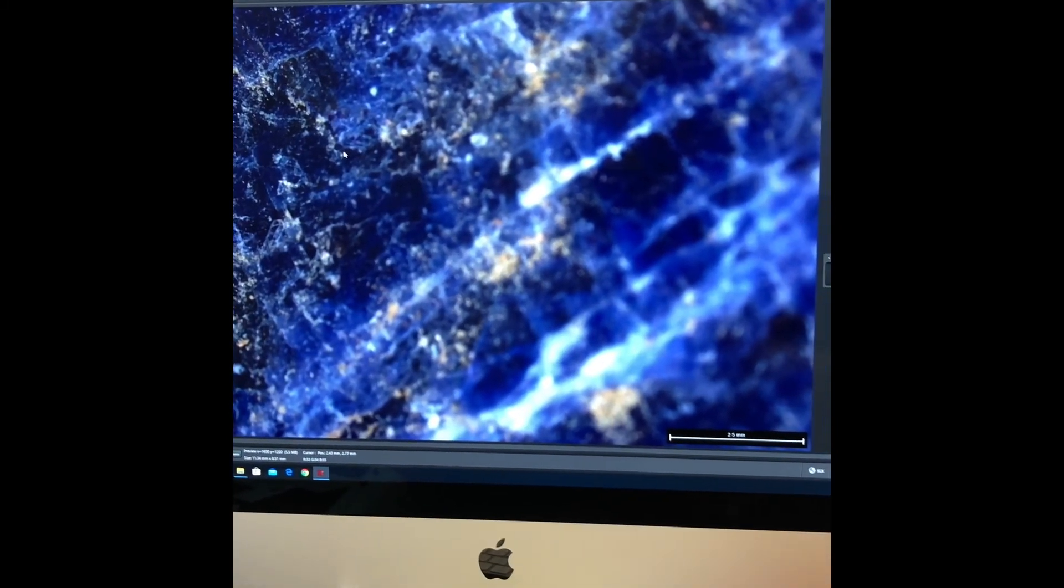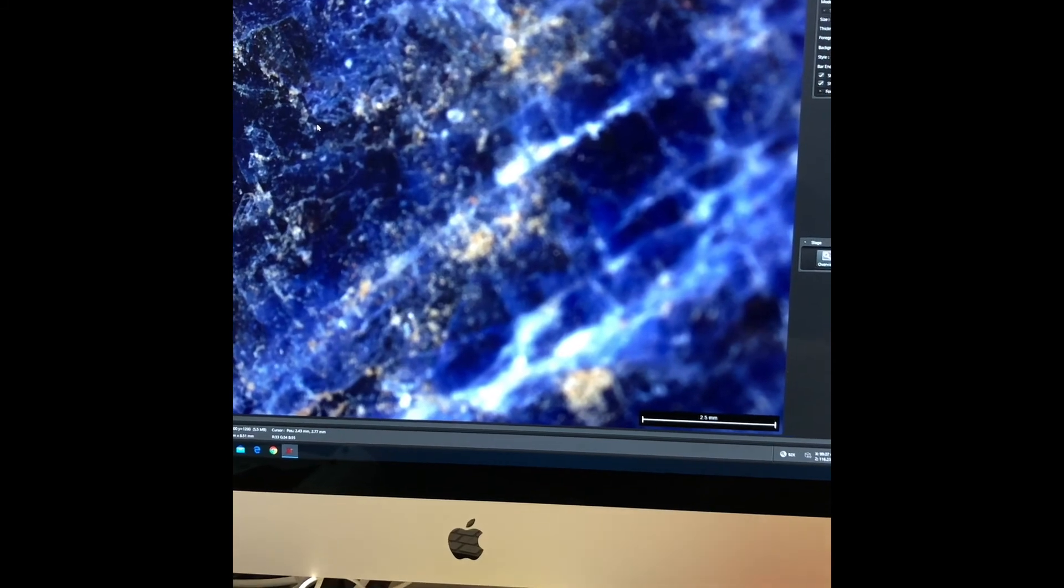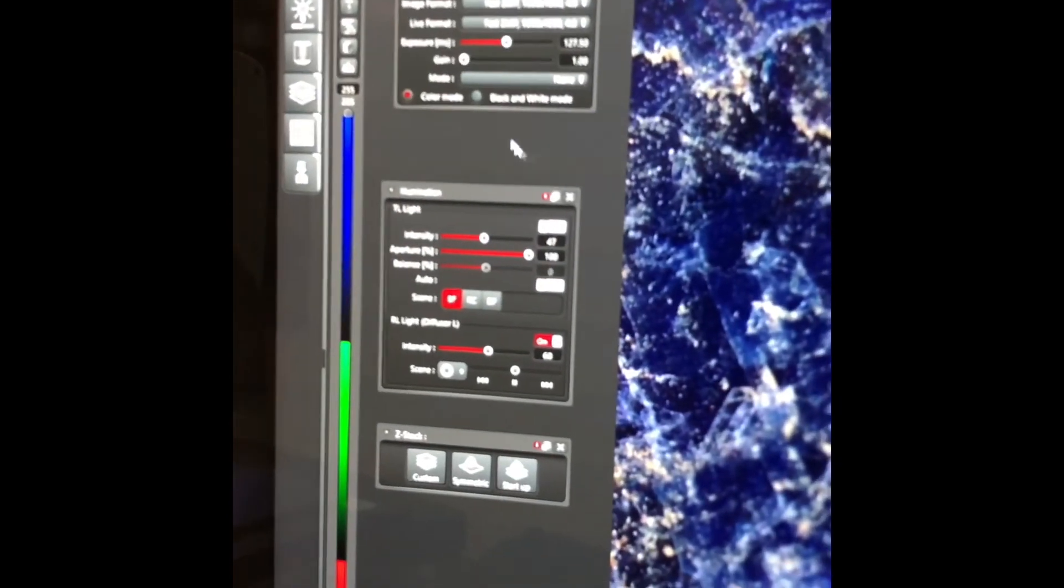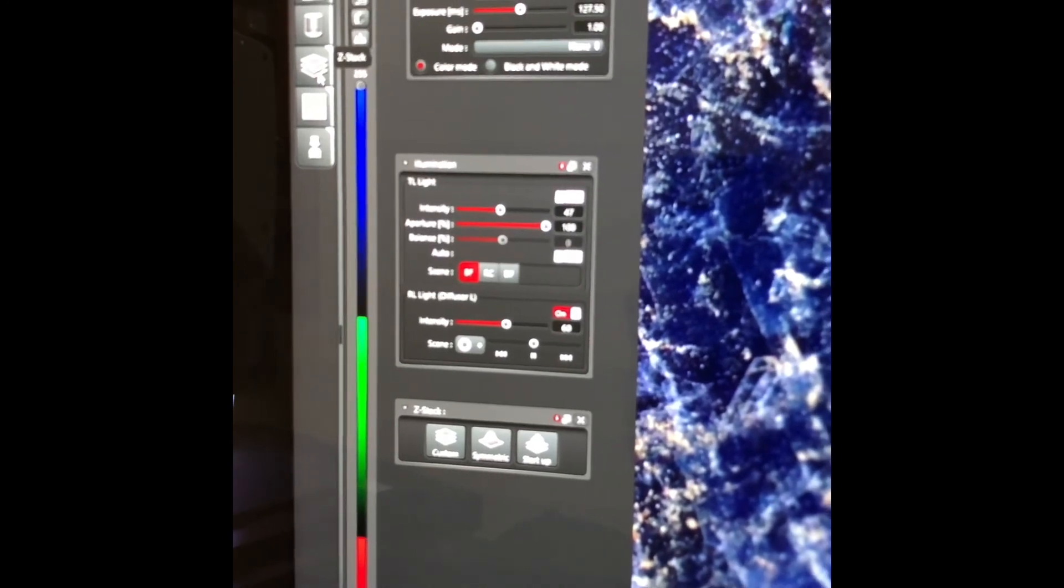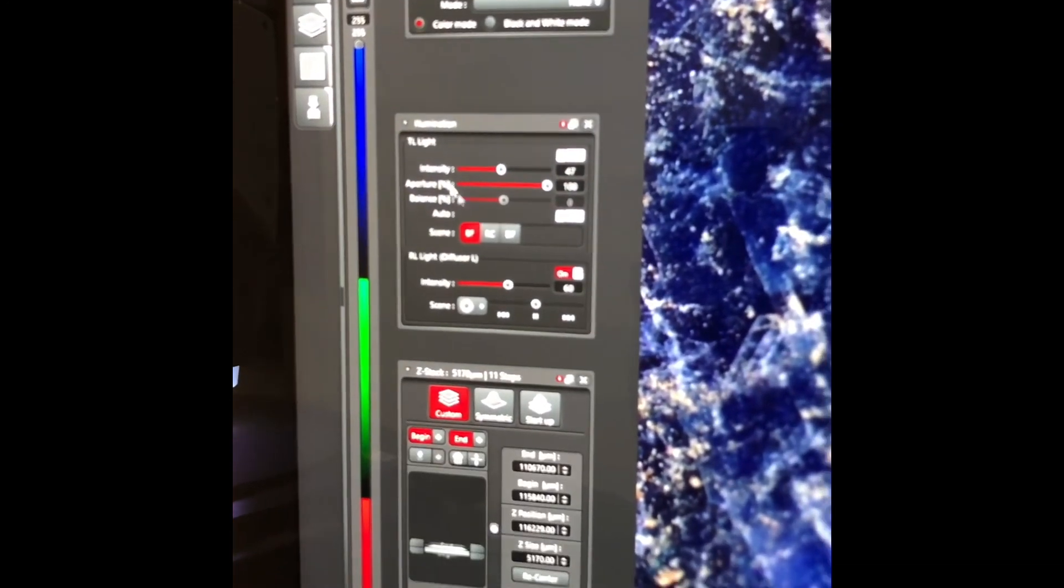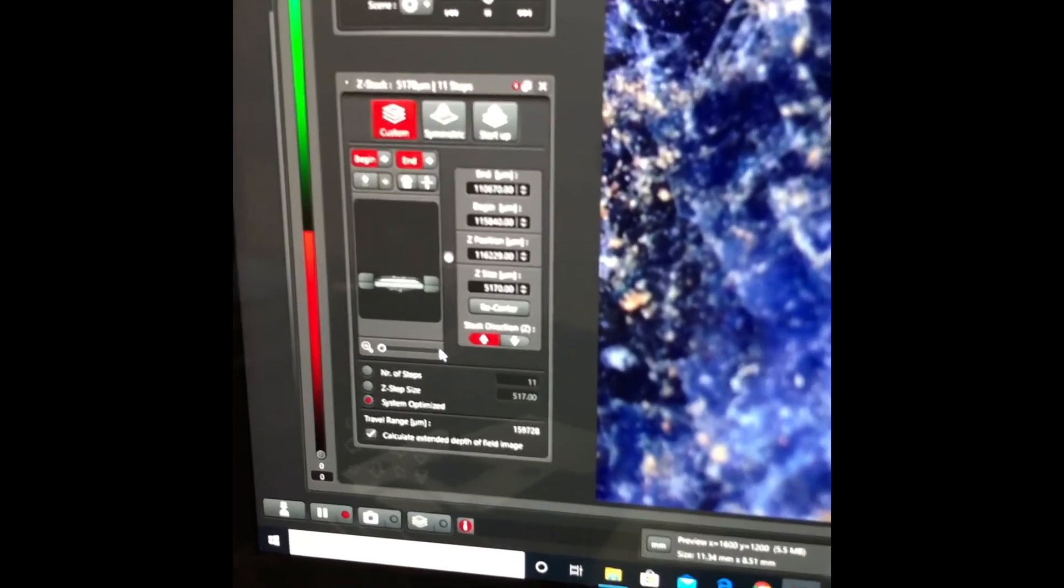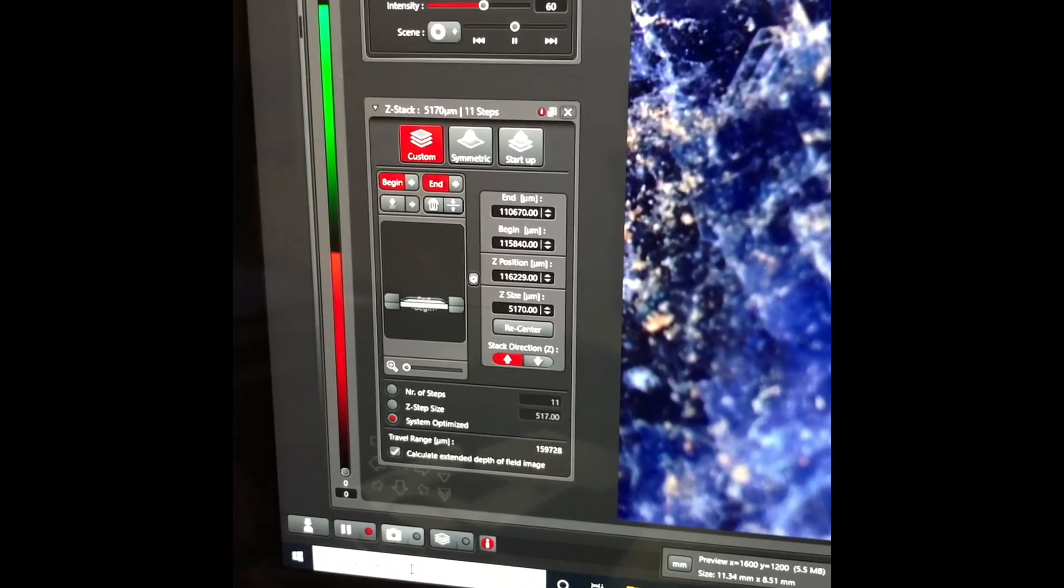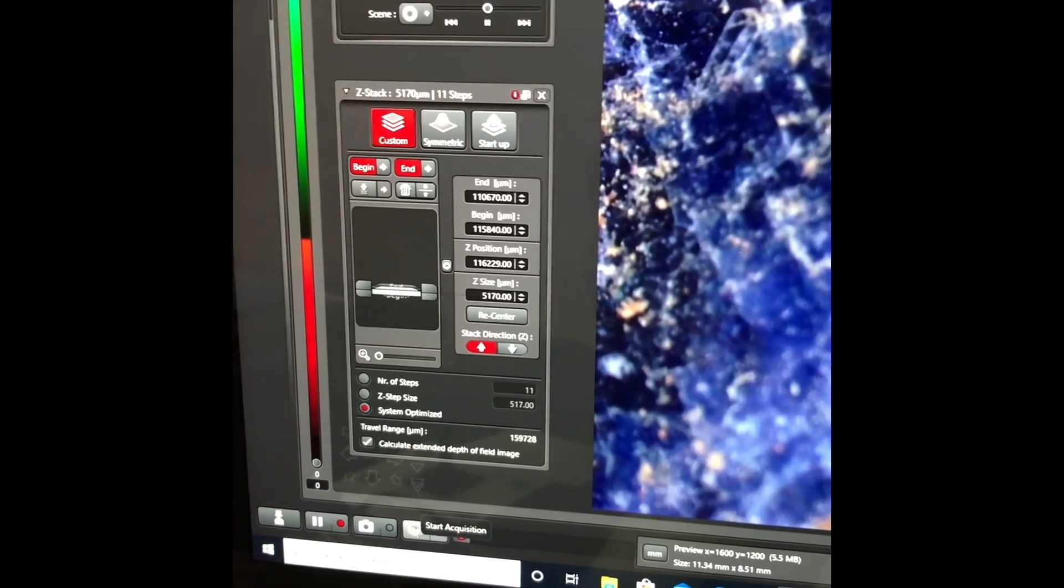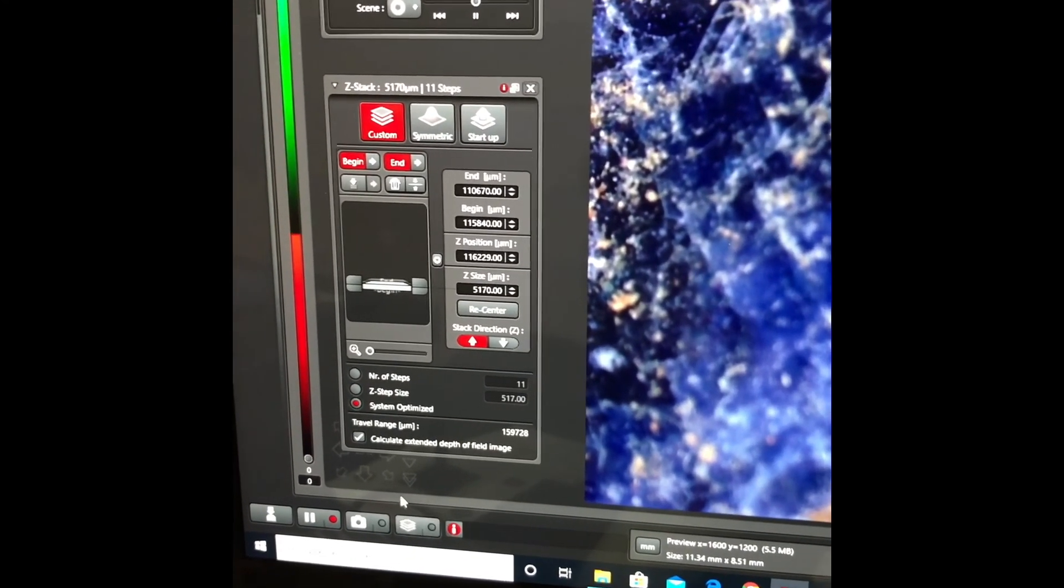To overcome that, we can utilize Z-Stack. The first thing to do is to turn it on. To do that, we come over here to the Z-Stack button and power it on. That'll open up this window and also give us this tab to press on the bottom once we're ready to run the Z-Stack experiment.